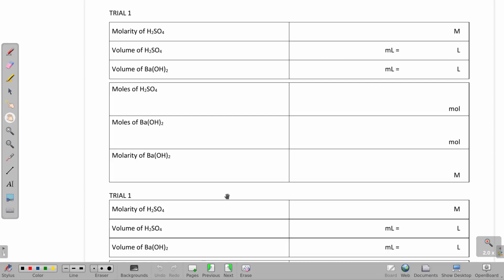Okay, so after I stopped recording, I actually went back and did my 2 runs and got a much better reading here on the amounts. All right, so first of all, let's put down the molarity. Now this was on the label in that container I was using. Now I was supposed to use 0.02 molar, but I only had this higher concentration stuff, which is why the titrations took so little. All right, but when it was all said and done the second time, now this was 10 milliliters, and it was 10.00 because of how that pipette works.